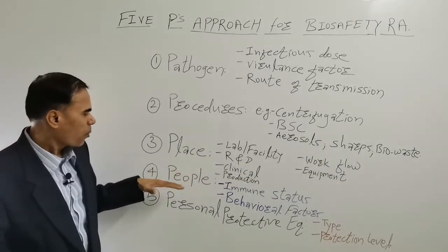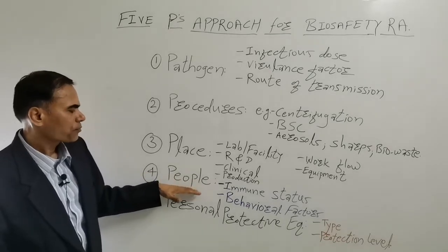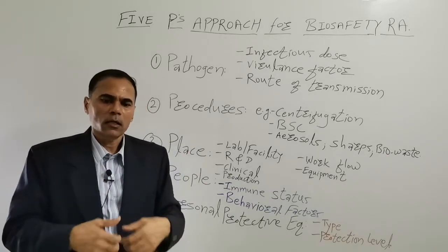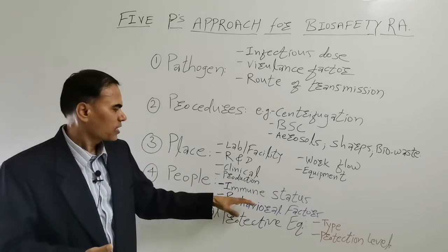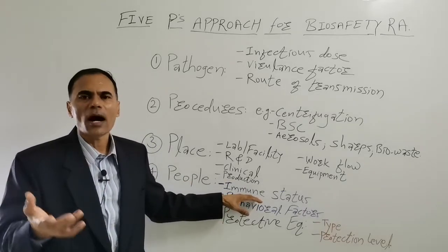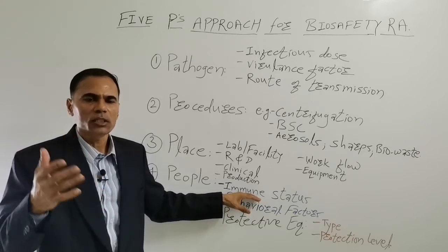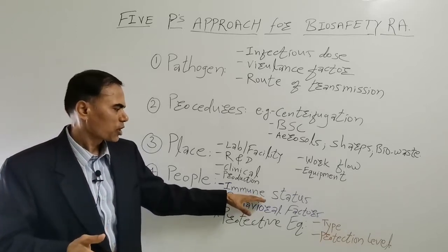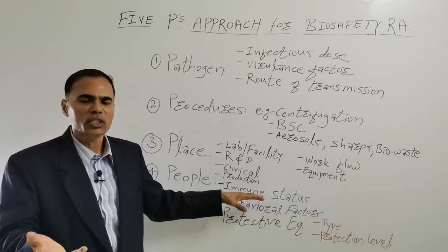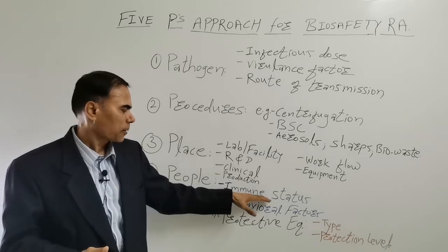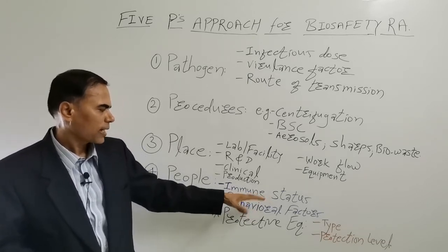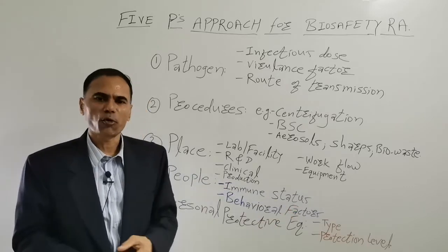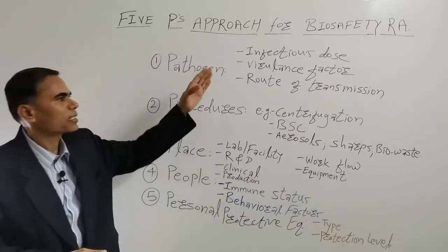The fourth P stands for People. You need to consider the people who are working there — their health status. Is there anybody who is immunocompromised? For example, if any researcher is pregnant and working in the laboratory, that also needs to be considered. Any laboratorian with an immunocompromised status must be considered. In addition, you also need to consider the behavioral factors of the humans, and based on that you can do the Biosafety risk assessment.